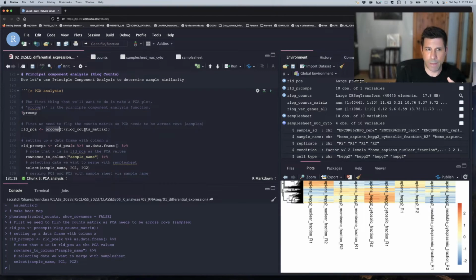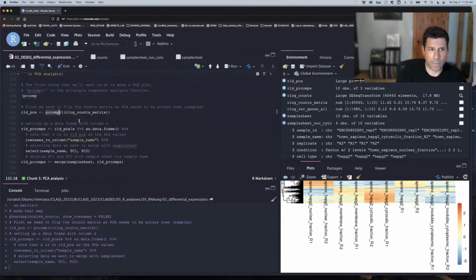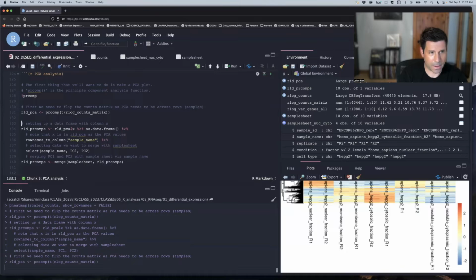When you do a heat map, you're going to want to scale your data. But for a PCA, you can just say, how similar are you based on the 40,000 genes we measured? How similar are the values? It's kind of like the clustering thing we did. We could make a meta plot if we wanted. So let's do that here, where we're going to run the actual statistics on the matrix. Again, we have to do this the long way here, and so we've left it long.